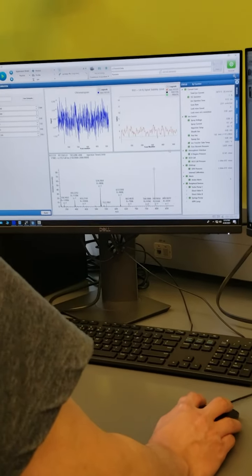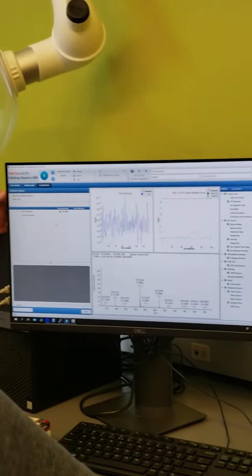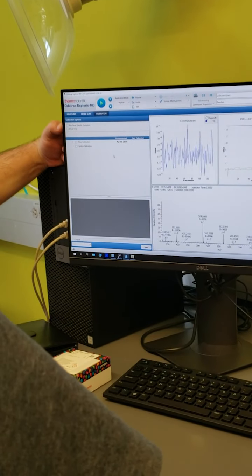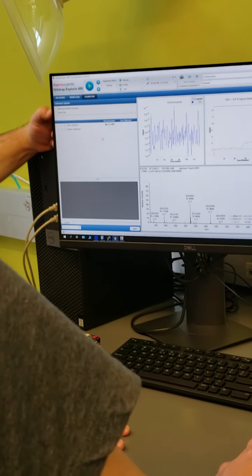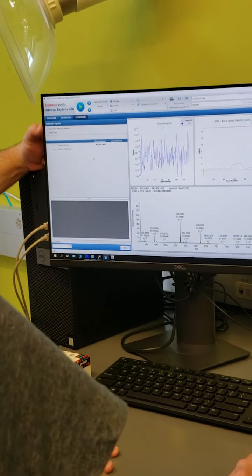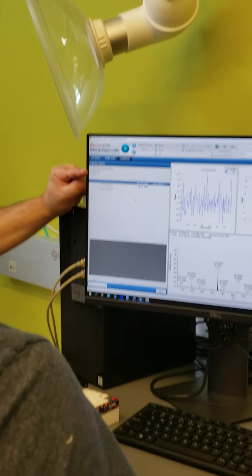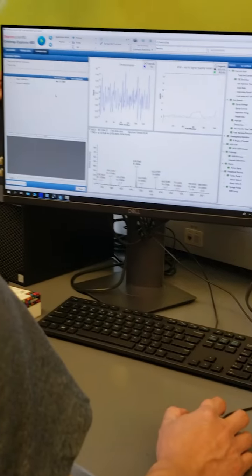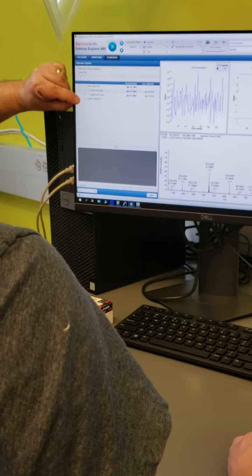All right, so you have a bunch of things you can choose from. You can tell it to skip the spray stability. So maybe you have a bad cal mix and you don't want it to fail, so you want to skip the stability and just get right to the calibration. I would never do that because you always want to calibrate with good spray stability. You also have the option to do the check only, and that is an evaluation mode. I would recommend you don't do that. Let's just go right to mass calibration and system calibration. Open it up.